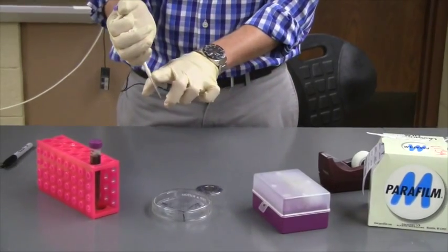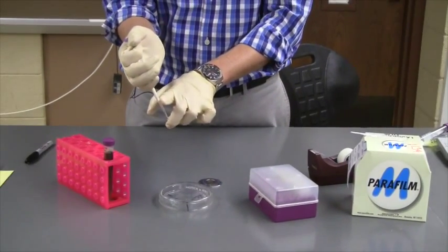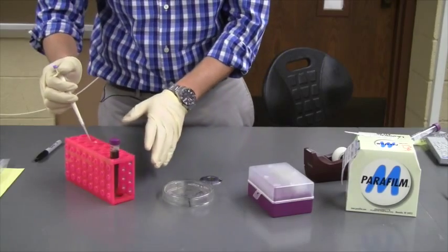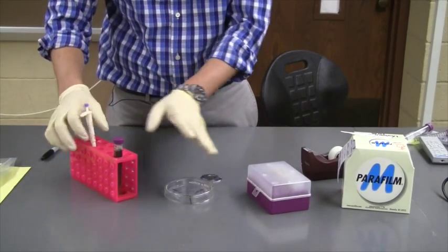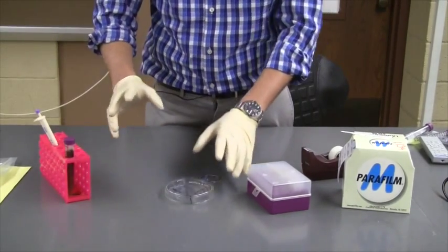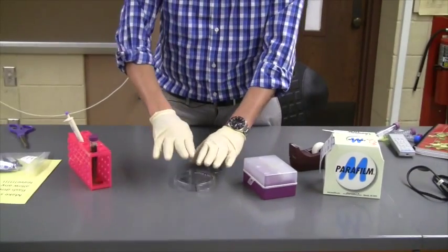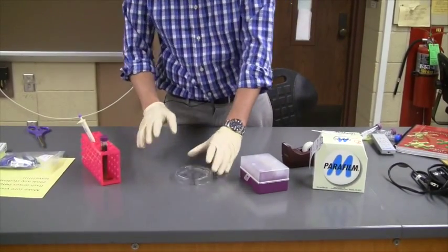Cover it back up. Normally I would dispose of this tip in a special container, but I'm going to move on to the next part here, so I'm just going to set this aside. Normally you'd throw that away. Then we're going to open up the lid and put a couple of glass beads in here.